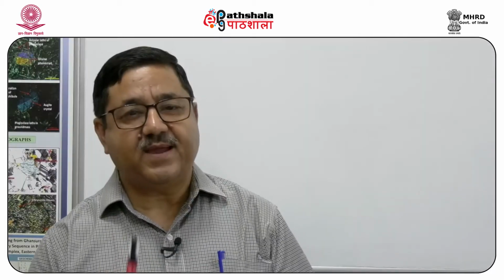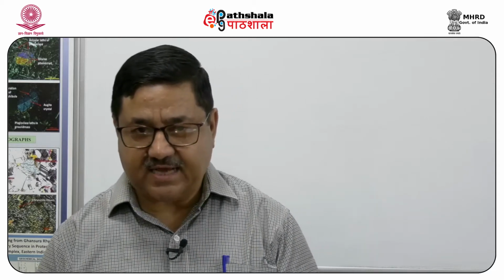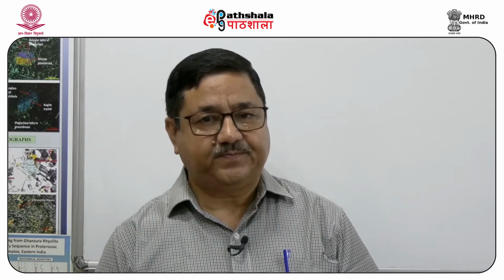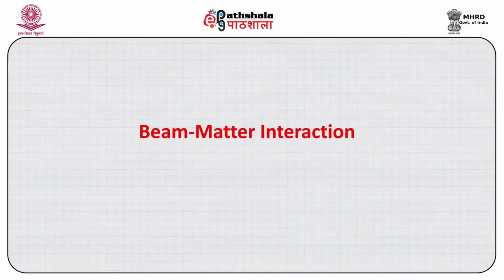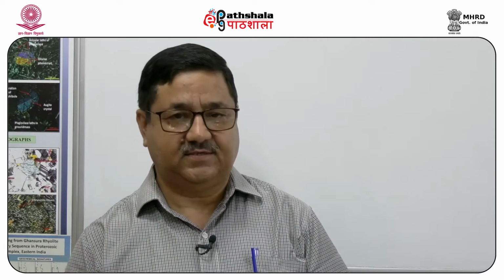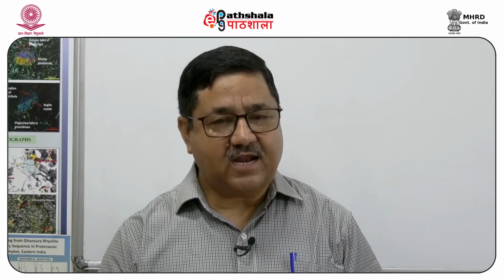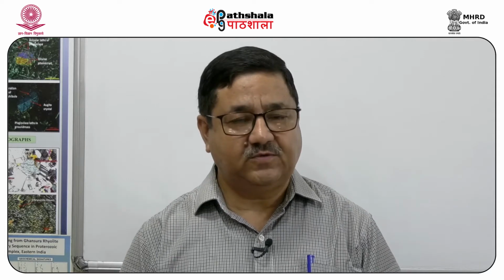What is actually meant by a scanning electron microscope is that you are doing a real time scanning, which means normally that you have a CRT or a cathode ray tube attached, where you are rastering an electron beam over the object of examination, and in real time you are seeing the effect of the electron beam on the matter. So, we come to what happens when an electron beam interacts with matter, because that is what allows us to have a look or peep into the material which we are seeing.